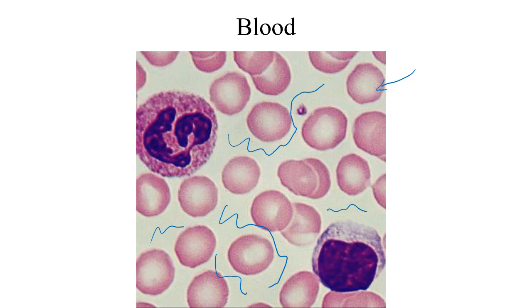But for our purposes right now, you don't need to be able to identify the blood cells. So you don't need to be able to identify any of the formed elements. You only need to be able to recognize that this is blood. And again, this is one of those ones that after you look at it a few times, it usually jumps right out at you.